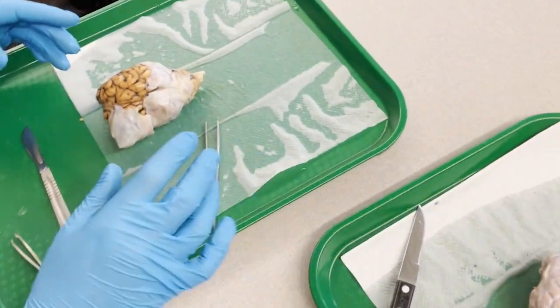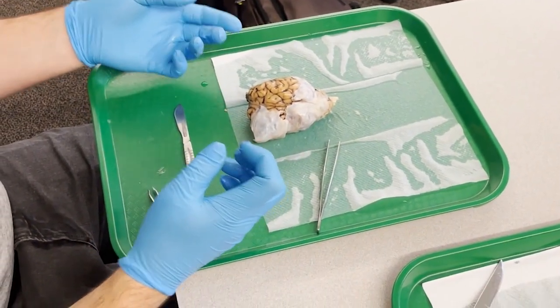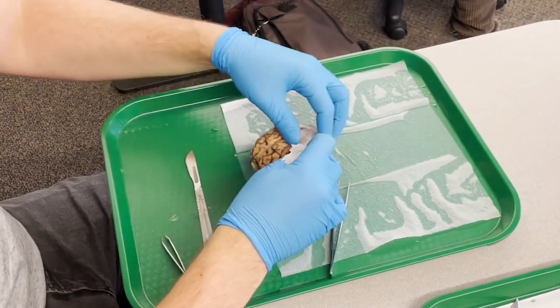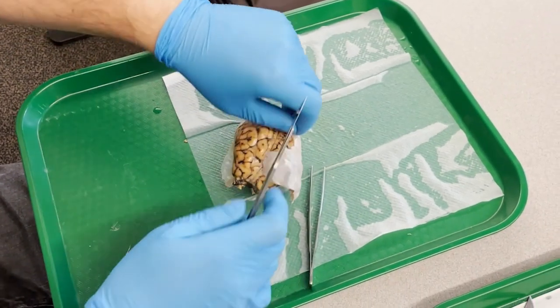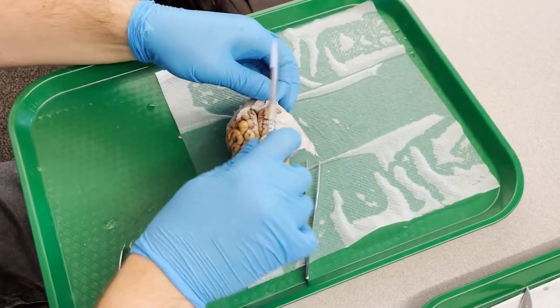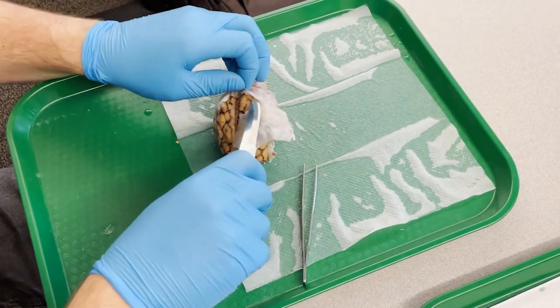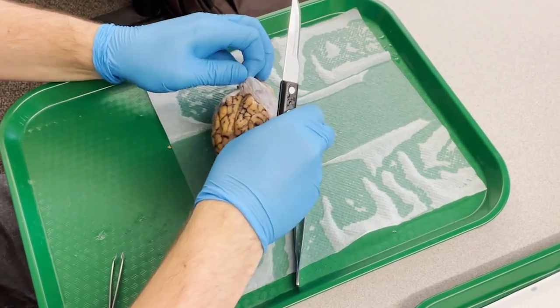So that's what you have to be careful about, because if you just pull it out, you're gonna rip apart the inner parts of the brain. So we don't wanna do that. We have to carefully cut and excise it. And so in doing this, I'm gonna continue to be careful about that. But we could see how over here now, I'm peeling out a very thick part there. Let's take the more dull knife. Okay. Peel that back some more.